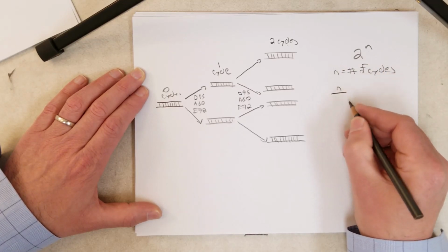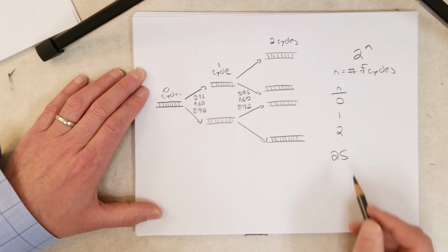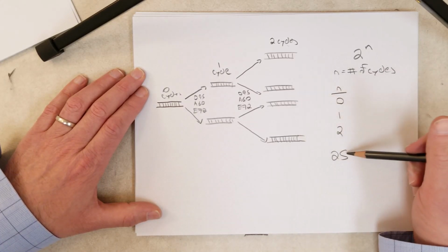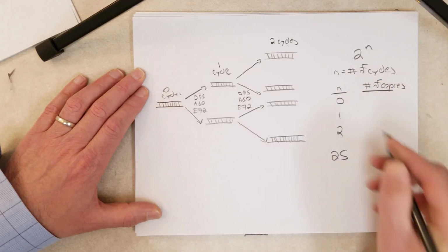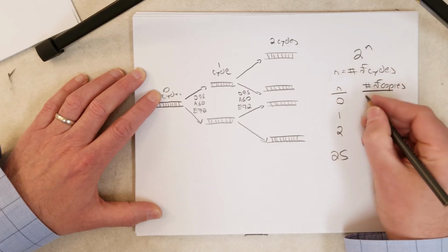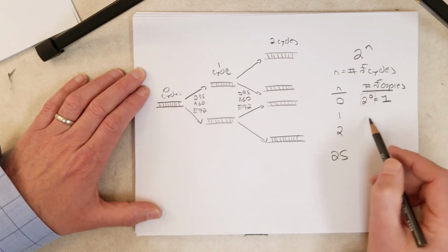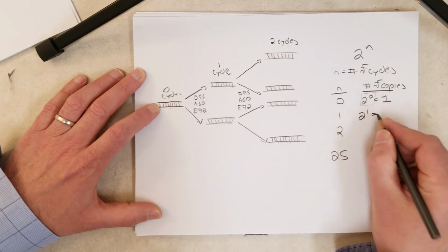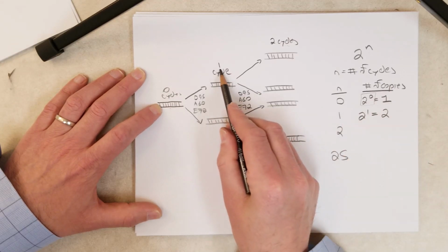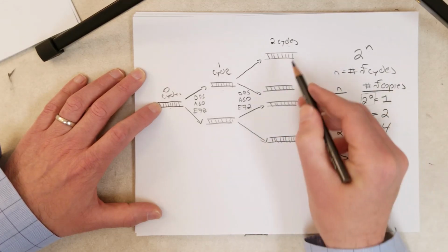Okay, so here we have n equals, let's say, 0, 1, 2, and then let's go to 25 down here. So 25 is a typical number of cycles you would run a PCR reaction through. So let's say number of copies of the DNA. At 0, 2 to the 0 equals 1, that's just how exponents work. Now that makes sense, right? One copy at 0 cycles. How about 2 to the 1? Well, that's going to be 2. And after one cycle, yep, we have 2. How about 2 raised to the second power? Well, that should be 4. So let's see, 1, 2, 3, 4.